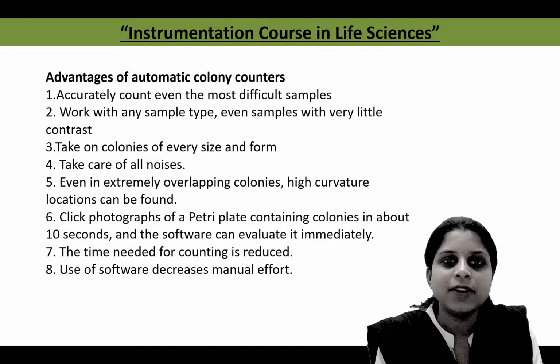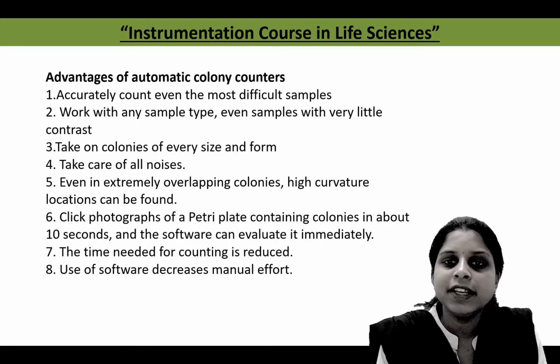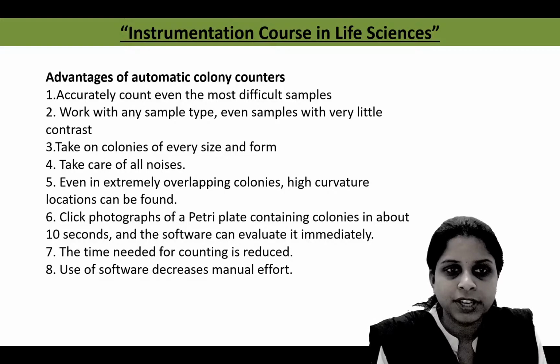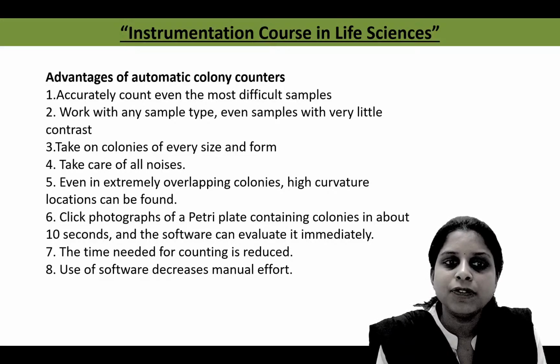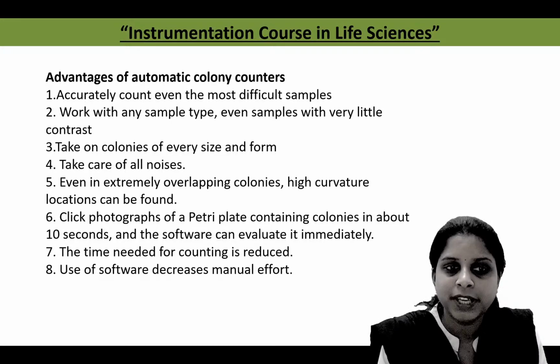There are some advantages of the automatic colony counter over the manual colony counter. First one, it can give accurate results from the most difficult samples. It works with any samples with very little contrast. It takes on colonies of every size and form. It takes care of all noises. Even in extremely overlapping colonies, high curvature locations can be taken.